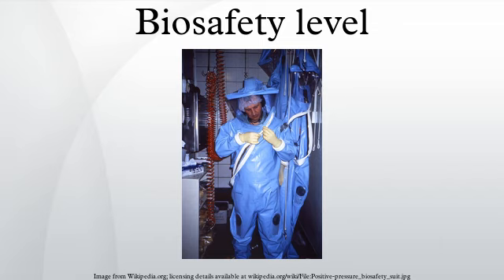Laboratory personnel have specific training in the procedures conducted in the laboratory and are supervised by a scientist with general training in microbiology or a related science. Biosafety Level 2. This level is similar to Biosafety Level 1 and is suitable for work involving agents of moderate potential hazard to personnel and the environment. It includes various bacteria and viruses that cause only mild disease to humans, or are difficult to contract via aerosol in a lab setting, such as C.